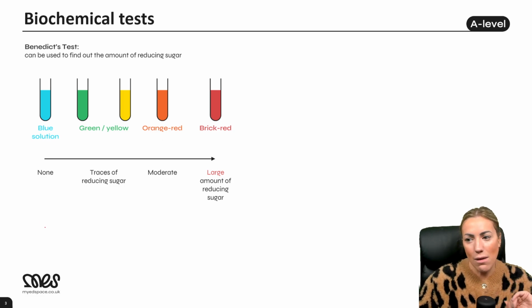Now, what we say about the Benedict's test is that it is semi-quantitative.